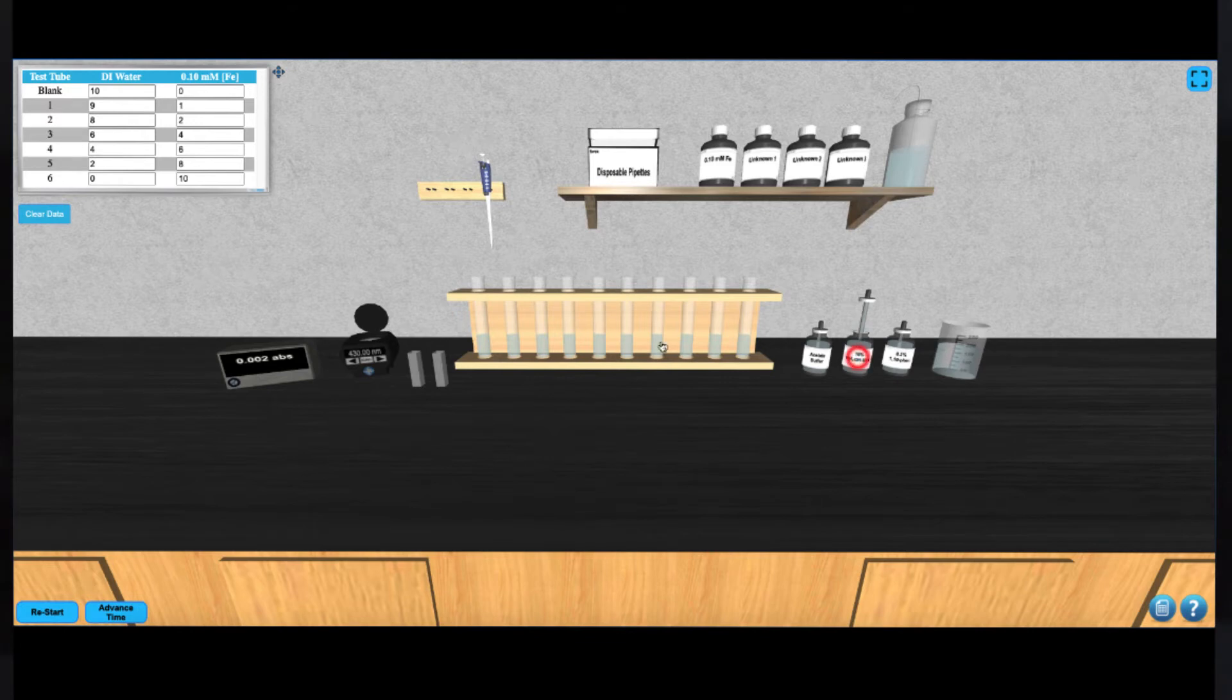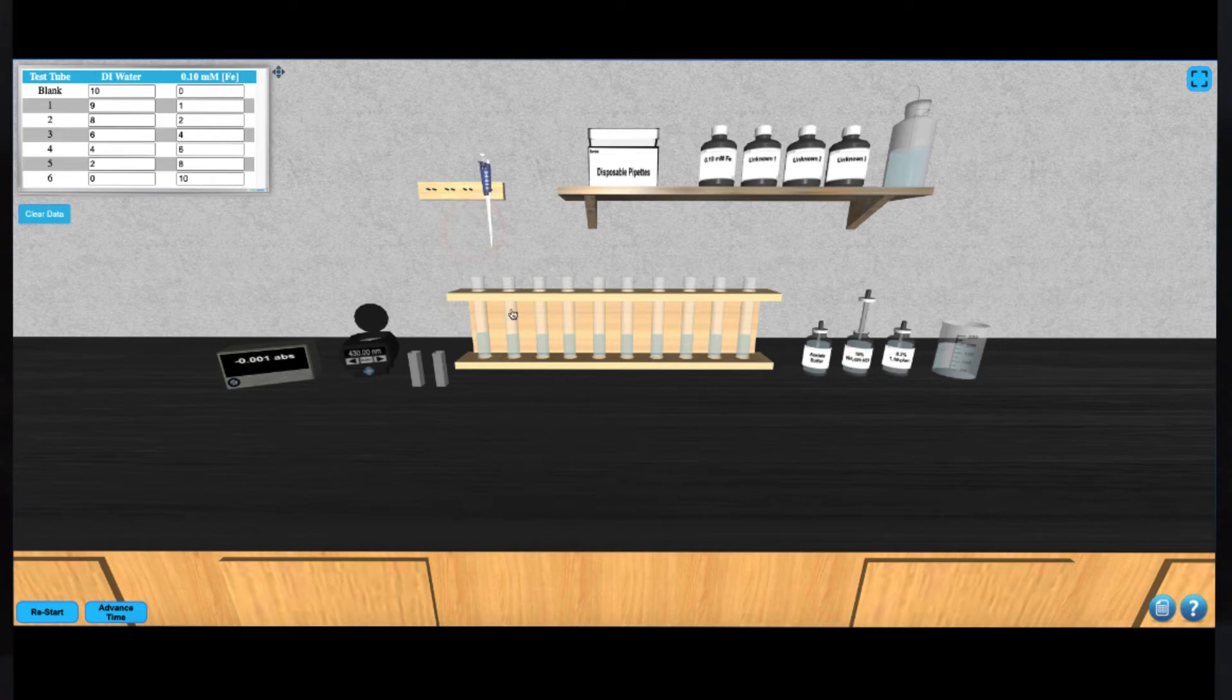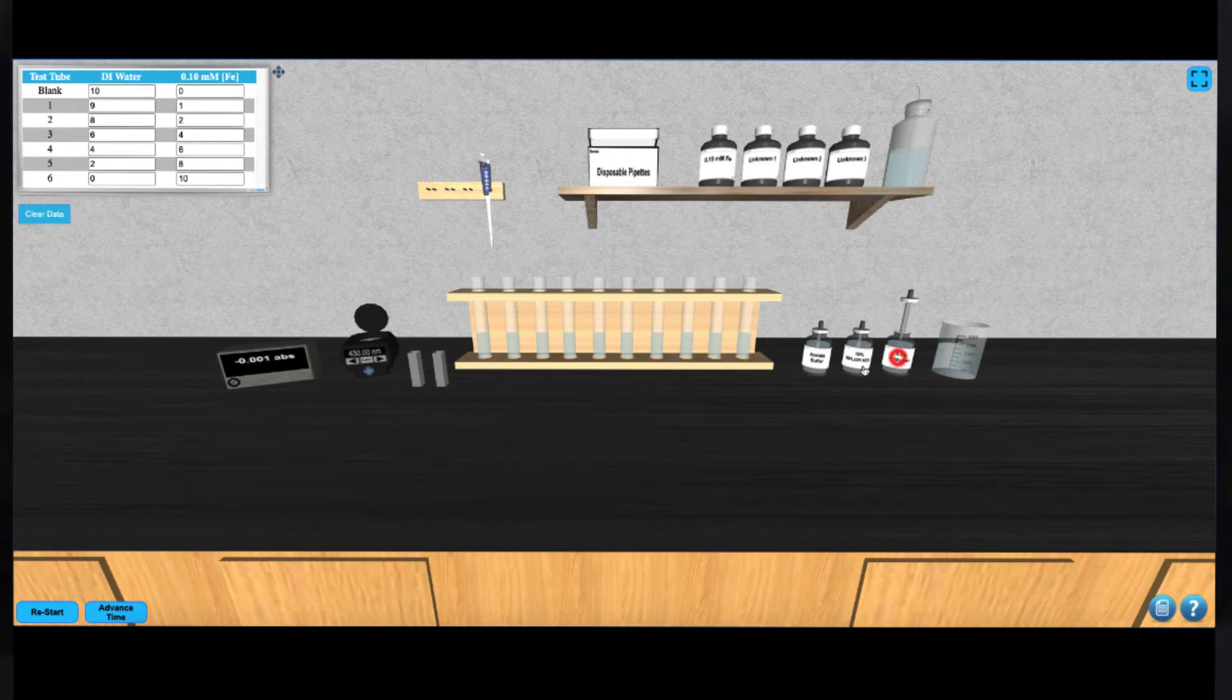Next, add 5 drops of NH2OH to every tube using the exact same procedure. Finally, add 10 drops of phenanthrolene to every tube using the same procedure.